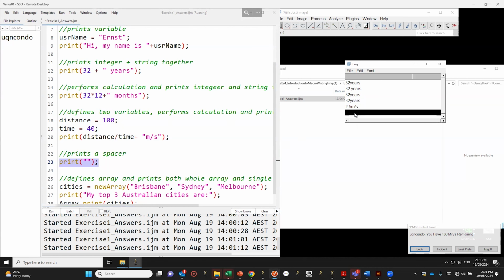So usually I would use this log window as a record of events. So when I have a big script for a user, or an analysis pipeline, it would usually be at the top: when did I run the script? What's the name of the script that I was running? Depending on things, where was the directory of images located?